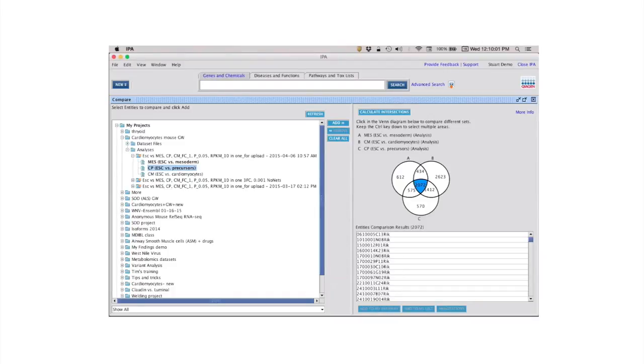We do have, in the future, we're working on having a gene level kind of heat map. That's something we're aiming towards, where in the comparison analysis you can see a heat map of the genes that are relevant to a given upstream regulator, as well as the heat map of the upstream regulators themselves. But we don't plan to increase that limit of 20 at this point.